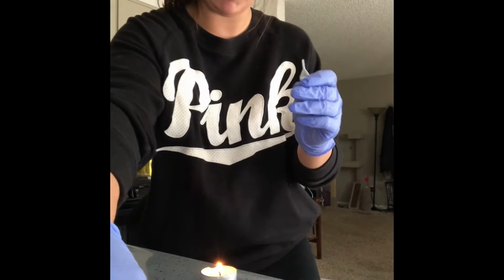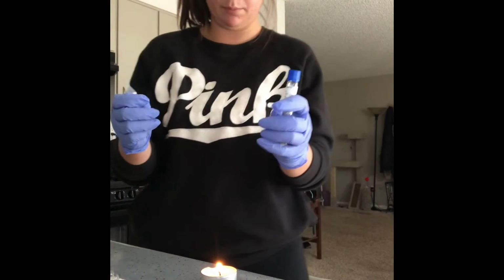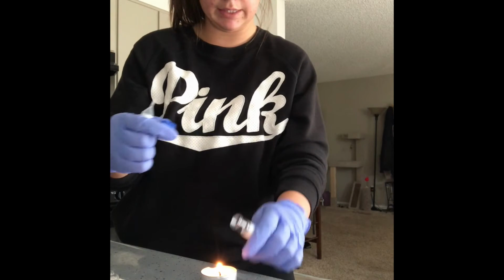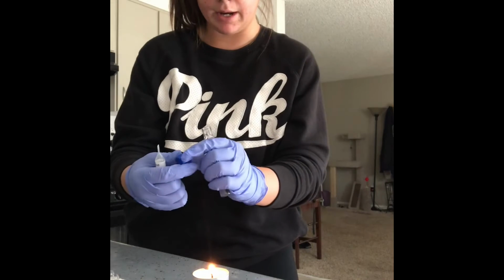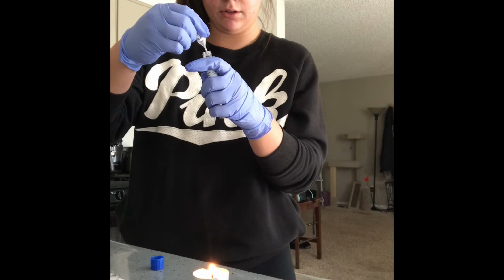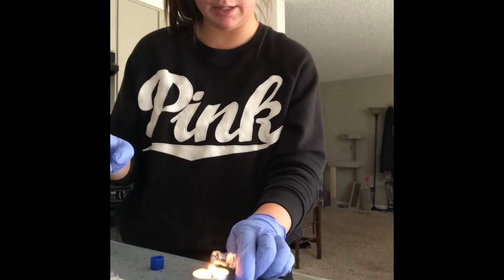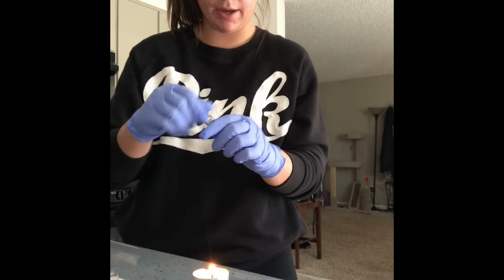Okay, so I have my hydrochloric acid pipette right here. I have S-epi pH of 5 right here. So I'm just going to sterilize this one really fast. And then I'm going to place 1 drop of HCl into here. And then I'm going to set this to the side and sterilize again. Place the cap back on.